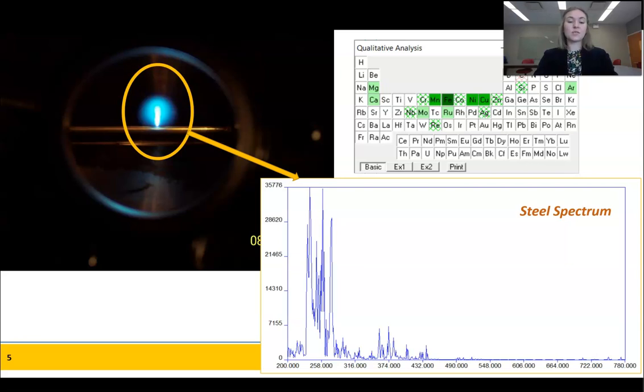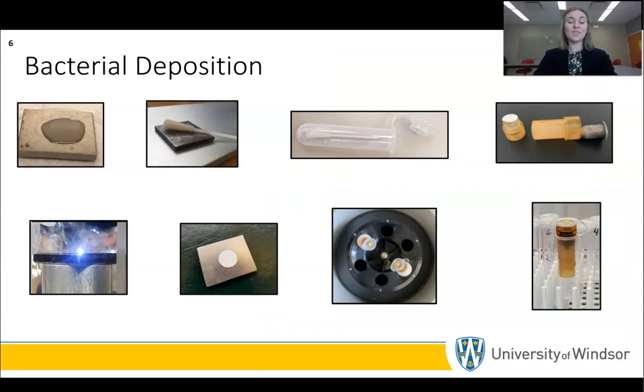This slide is essentially showing that the structure of the analyte is important because LIBS works best on solid, flat surfaces. These types of surfaces produce the best plasmas, and that's why we've worked very hard to develop a procedure to deposit bacteria as thin films on a substrate, as opposed to just shooting a laser into a vial of fluid. Our procedure for bacterial deposition is meant to simulate swabbing bacteria off the skin or other surfaces of the body.